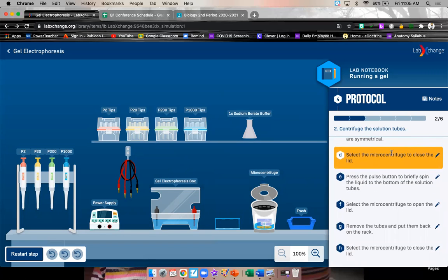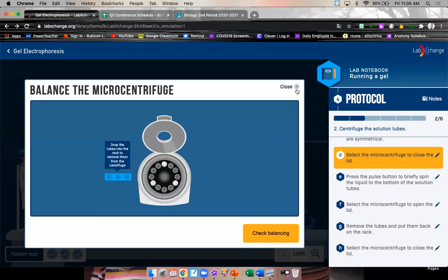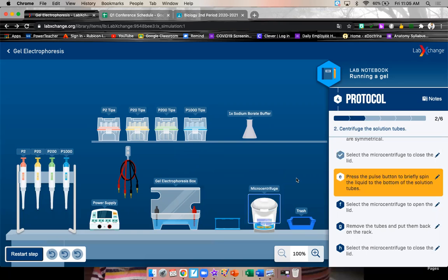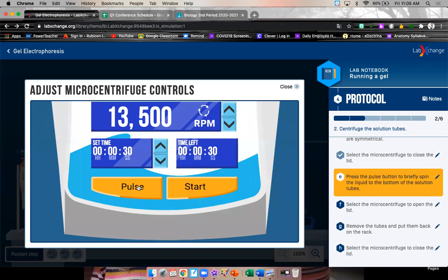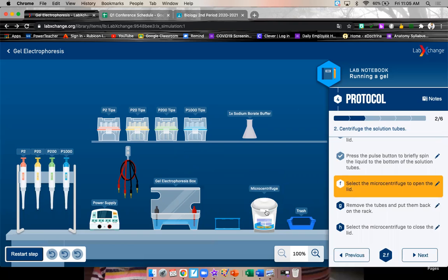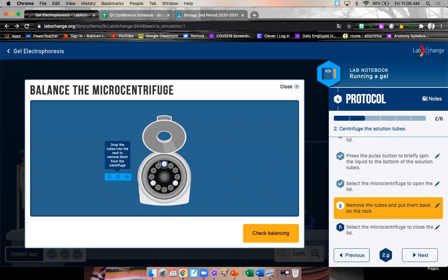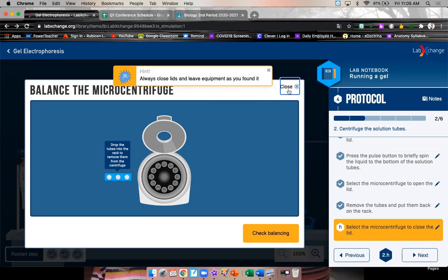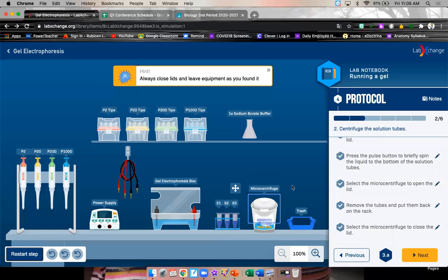Select the microcentrifuge to close the lid. There we go. Press the pulse button to briefly spin the liquid to the bottom of the solution tubes. Pulse for 30 seconds. It's sped up for us. That's fun. Open the lid and remove the tubes to put them back in the rack. And then close the lid. Always close the lid.